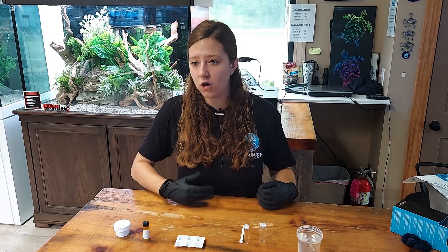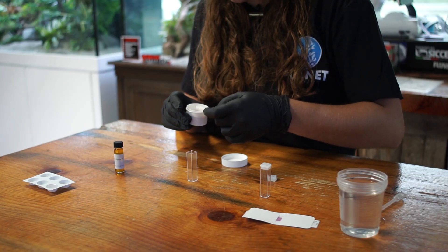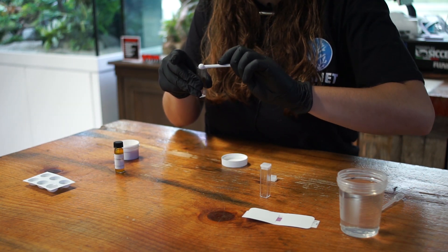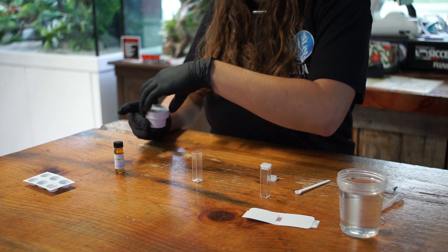Next we are going to do the low range iron test if you are trying to test for a lower value. For this test, the first thing you are going to do is take your iron one powder reagent and add one level scoop into the cuvette. One thing to note is that the cuvettes do have a slightly rounded bottom, so be very gentle with them and do not accidentally bump them because they can tip over very easily.